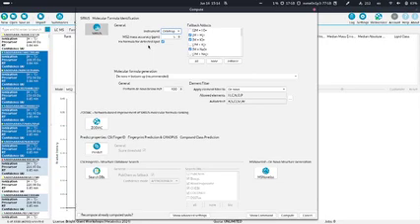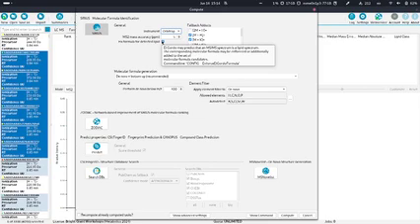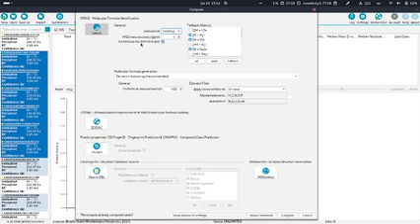When it detects that your compound is a lipid, it will also detect the molecular formula of the lipid. And if this box is enabled, this means that if we detect a feature as a lipid, the formula of this lipid will be fixed. So the computations we do later on will only use this formula.